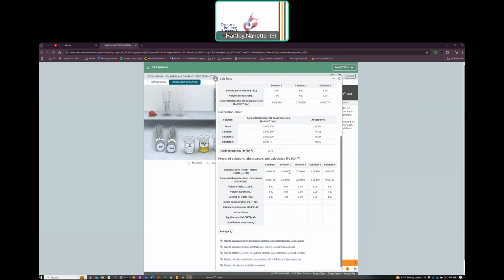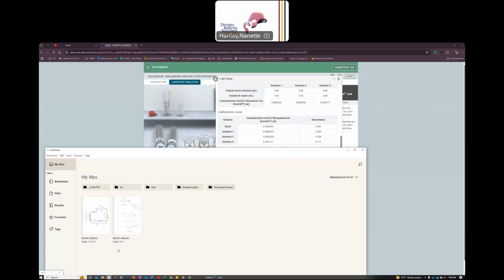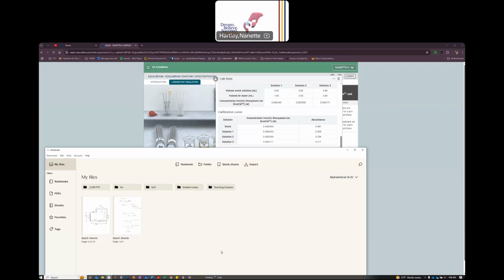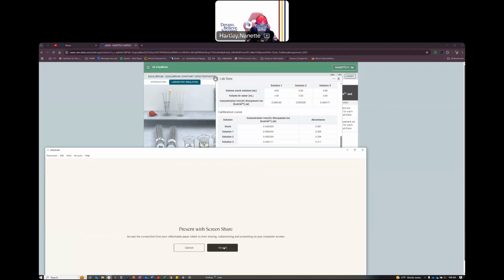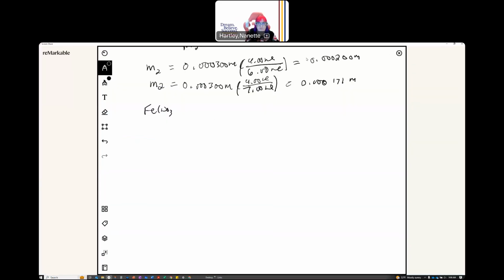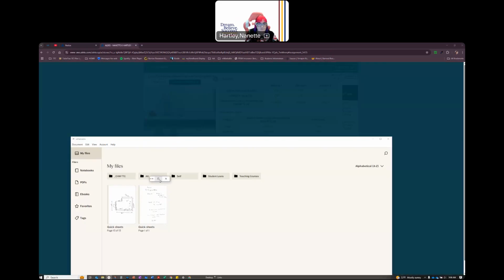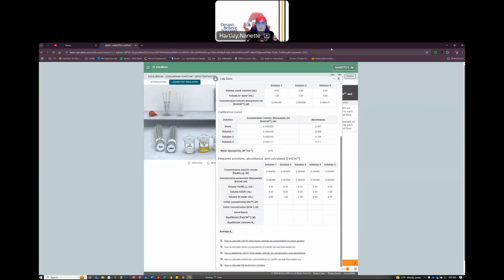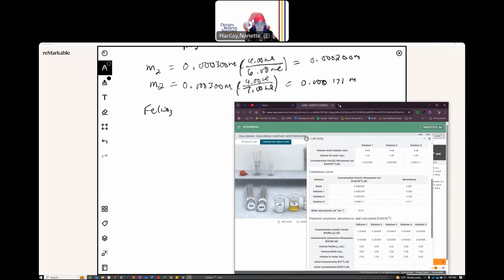So I have 5 milliliters of that FeNO3, and the volume of that equals 5.00 milliliters.